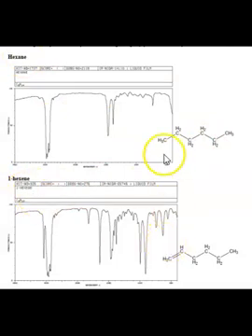So that's the only difference between these two molecules, the C double bond right there on the end, okay? So what do we notice? Well, this peak here that we had in the original hexane is a little bit larger here, and we're not going to get into the reasons why, but now we have this other peak right here that is to the other side of the 3000. And so we can look that up and see if that tells us anything specific. We are going to find out that it tells us about that double bond there.